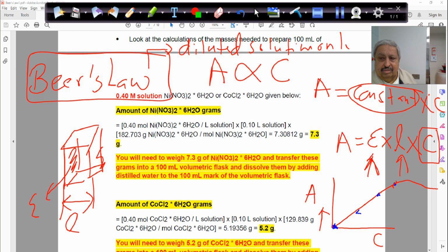Now if somebody tells you to take not 0.4 molar but 3, 4, 5 molar, maybe I'll put this in a multiple choice. Can I measure a 5 molar solution with the spectrophotometer using Beer's law? The answer is no. If I have 4 molar or 5 molar, I'm not getting this. I'll be getting something looking like this. Not a linear relationship.